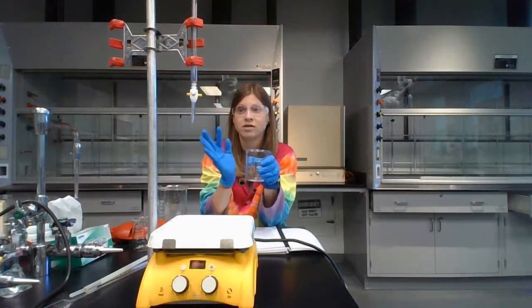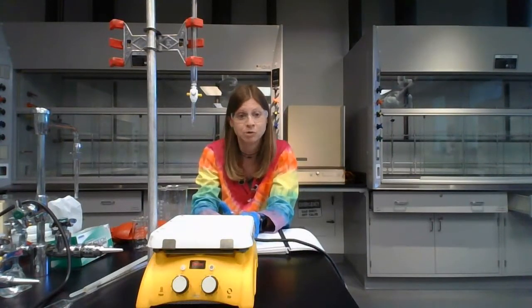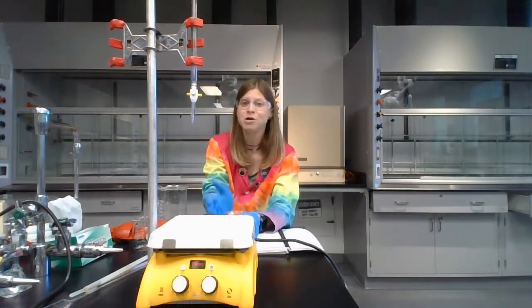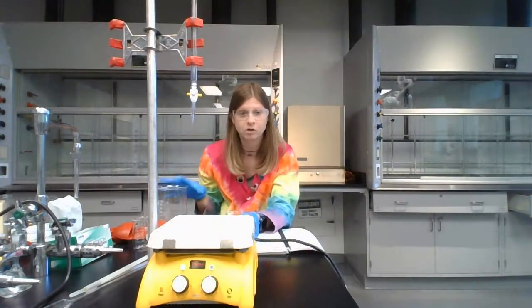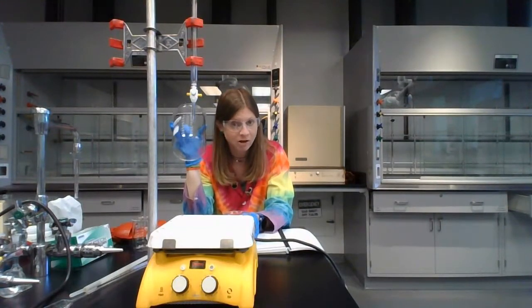Make sure that the solutions you condition with go into a waste beaker. I guess now is a good time to say that there are going to be two different waste beakers for this lab. One will be for the pure purple potassium permanganate, lots of P's in that. So it's the purple stuff that did not mix with anything else, like when you conditioned your burette. You're going to put that into the waste beaker for potassium permanganate. That beaker can be small, like a 250 milliliter beaker. Your other waste beaker should be a large one, like a 1 liter beaker, and that's going to be for the reacted solution. So that's for any chemicals that touched each other and mixed together with something else. That'll be a much bigger container.